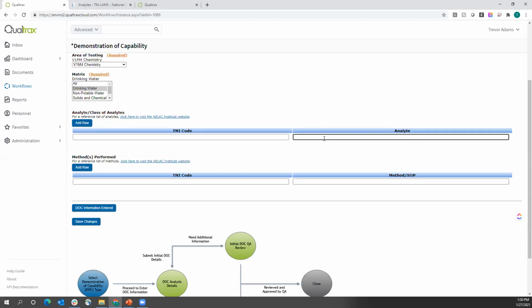So we left it as text boxes so that you could either type in the analytes you're using and the methods you're using, or you could just very quickly swap these out for your own list of things that you test for, right? So very, very intentional why we did that. We can absolutely help you make that switch.